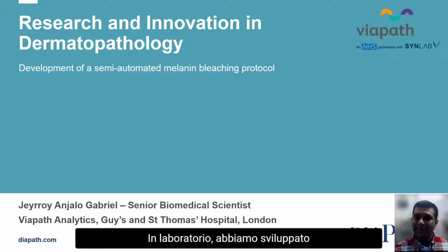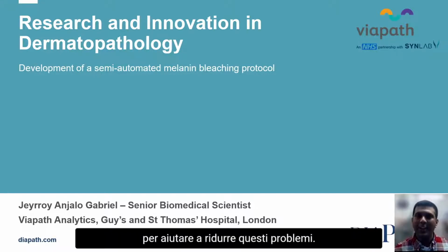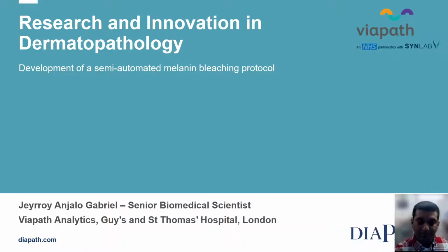So in the lab, we developed a semi-automated method for melanin bleaching to help alleviate these problems. That's what I'm going to run through with you today, in the lecture titled Research and Innovation in Dermatopathology: Development of a Semi-Automated Melanin Bleaching Protocol.